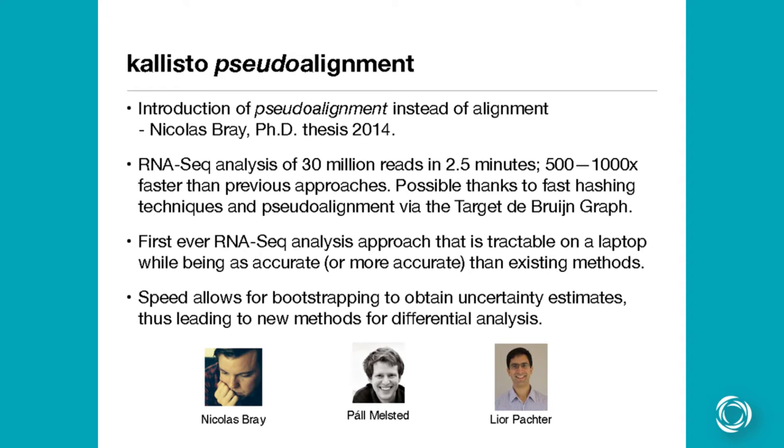So what are the trade-offs in terms of aligning to the genome versus aligning to the transcriptome from this perspective? As far as quantification is concerned, both of them are pretty comparable. I think all the benchmarks show that most tools are more or less in the same area. It depends what you're benchmarking, and benchmarking is a bit of a subjective art as well. As far as quantification is concerned, it's kind of a black art in the sense that everyone's trying something, everyone's doing something pretty good, and I honestly can't tell you which is the most correct thing to do.